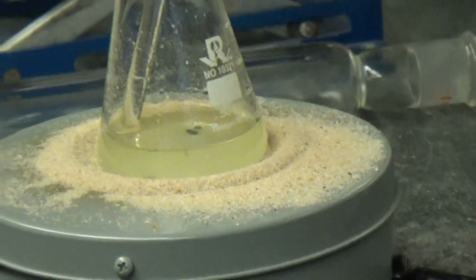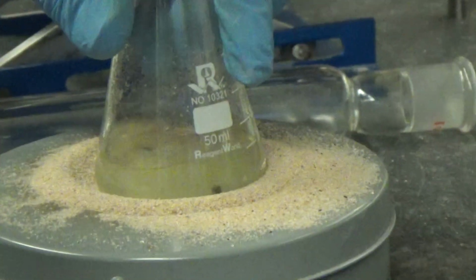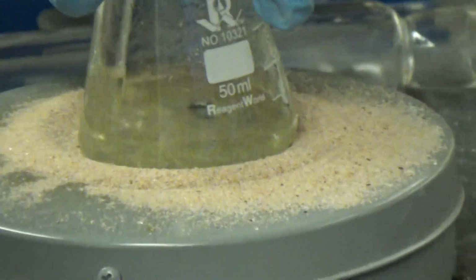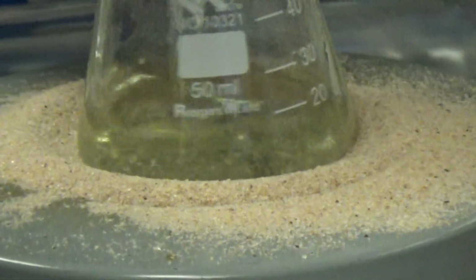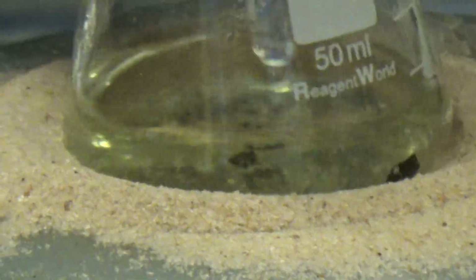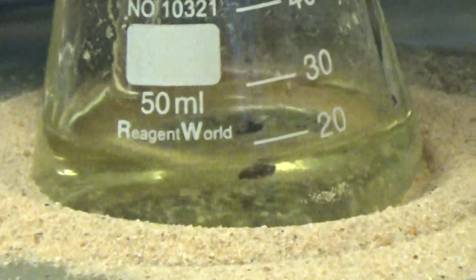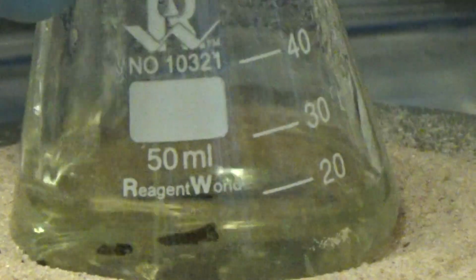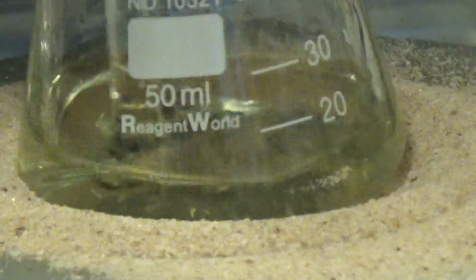Agitating it until it dissolves? Has any of it dissolved yet, or no? Some of it has. It has to completely dissolve first. It's getting there. Are those the boiling stones from before? Yeah, I think so. I will take them out, which is okay. That's not going to hurt anything. Completely dissolved.